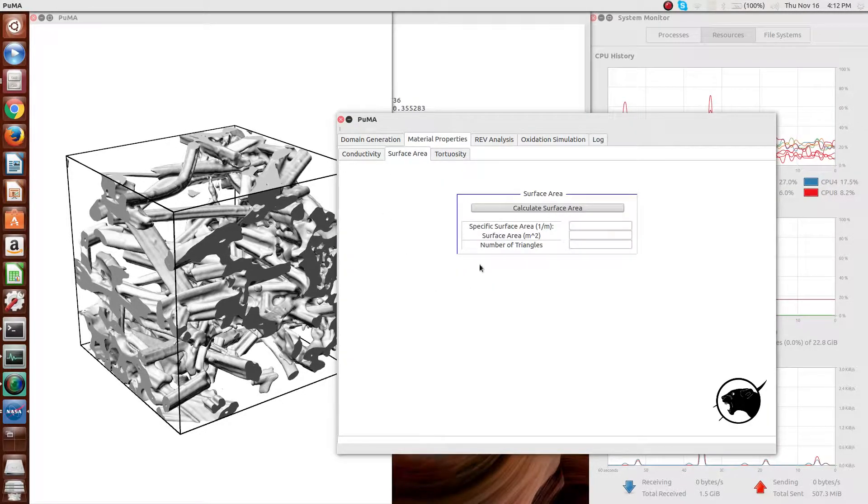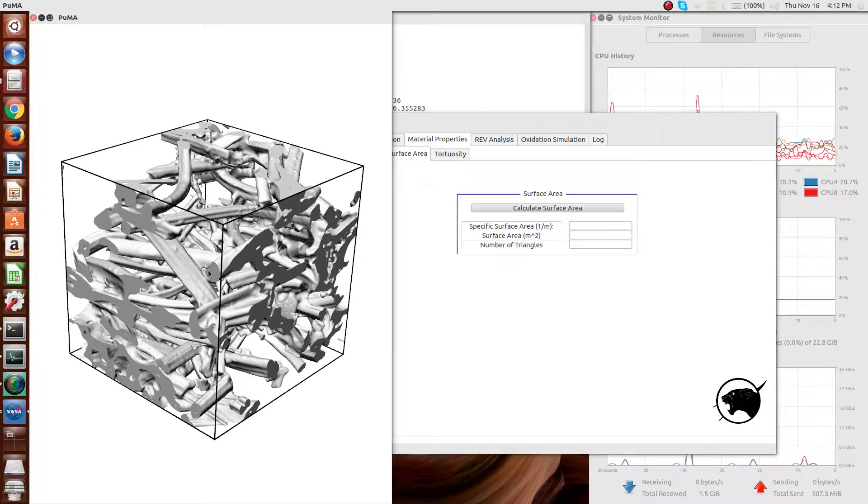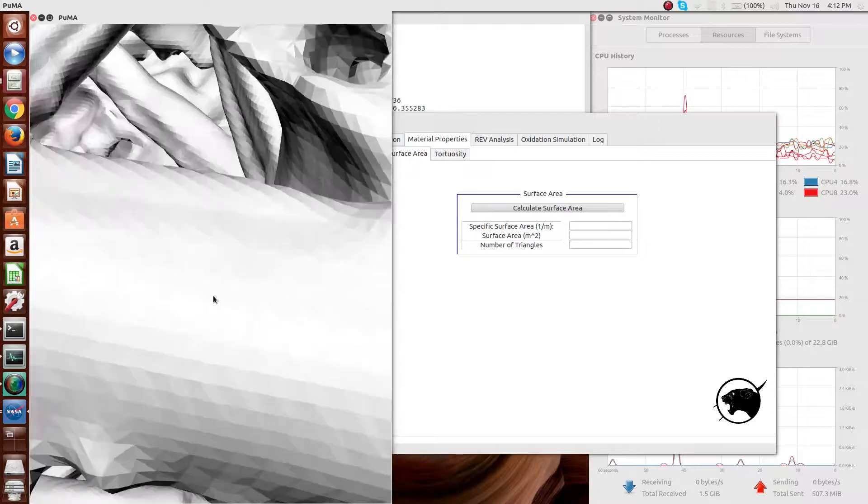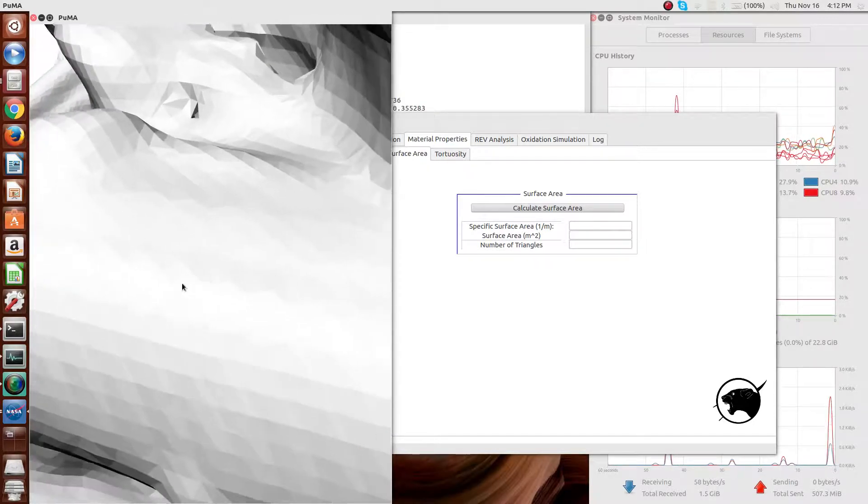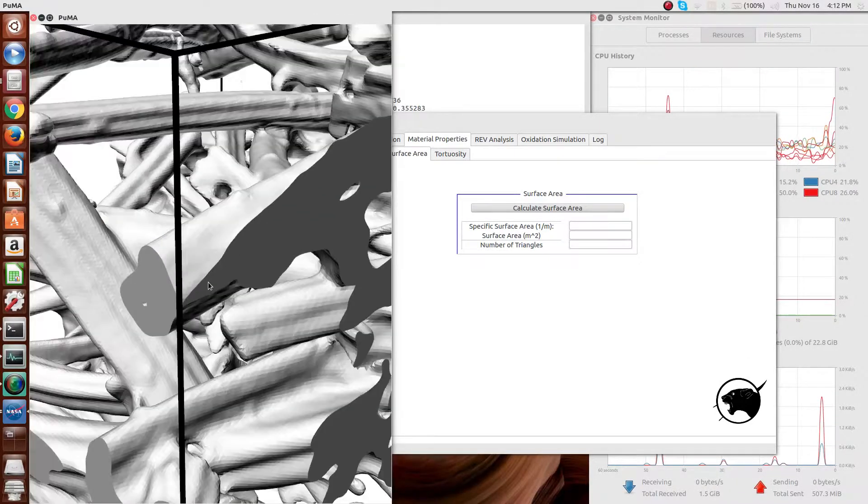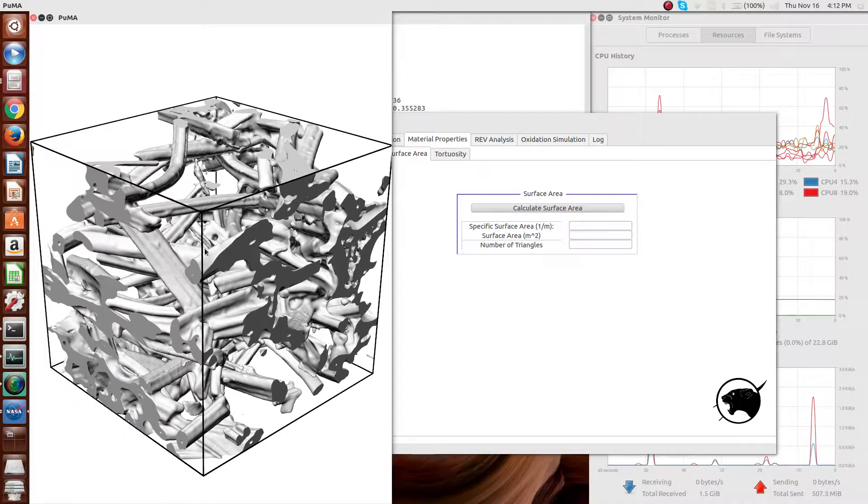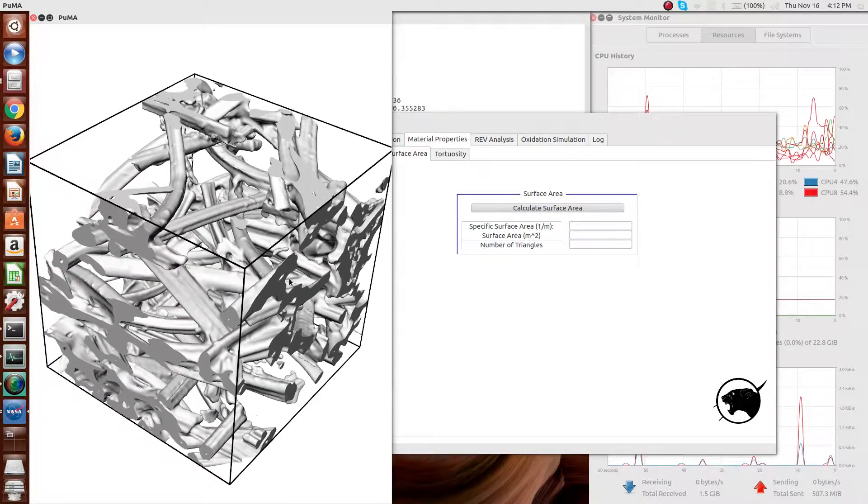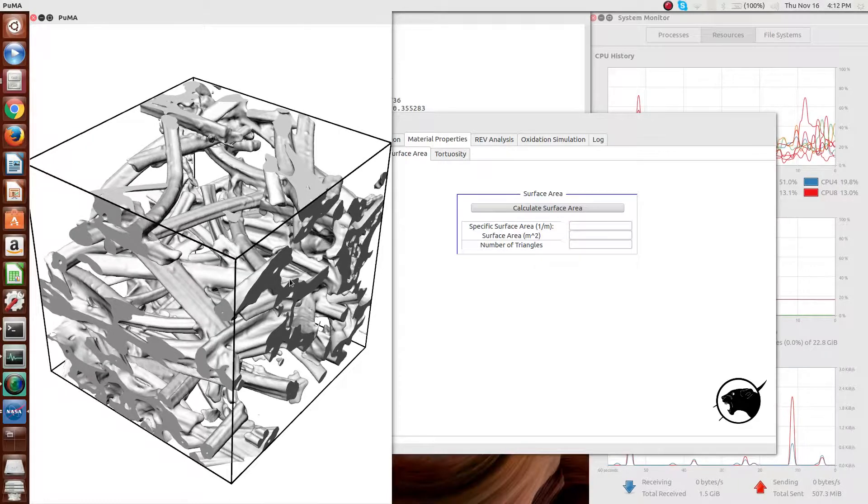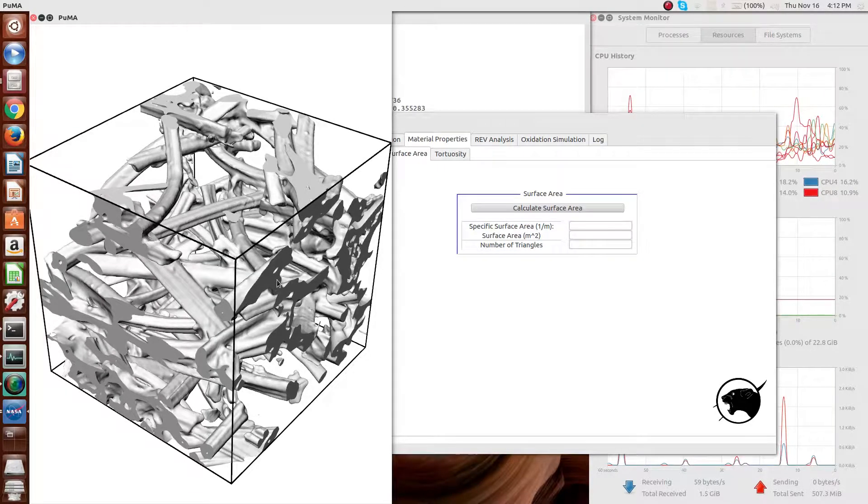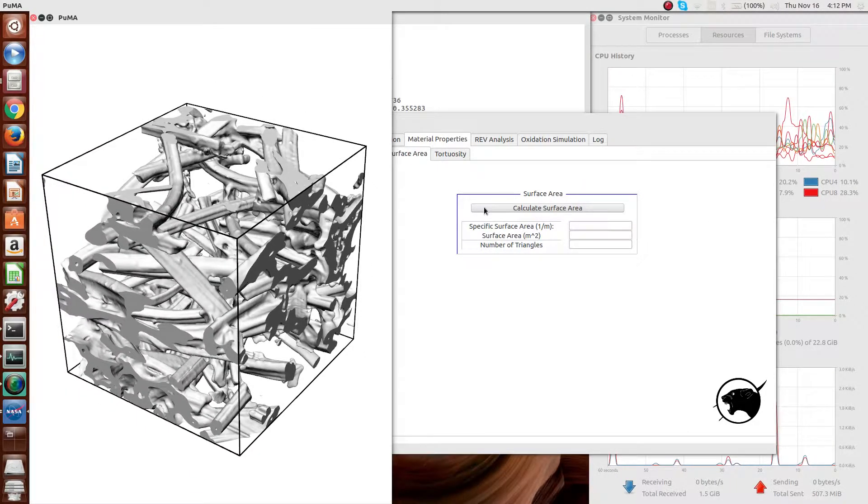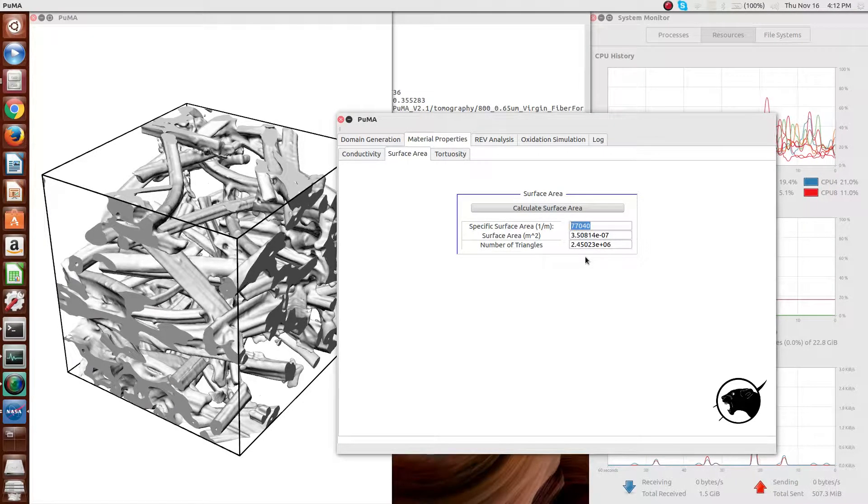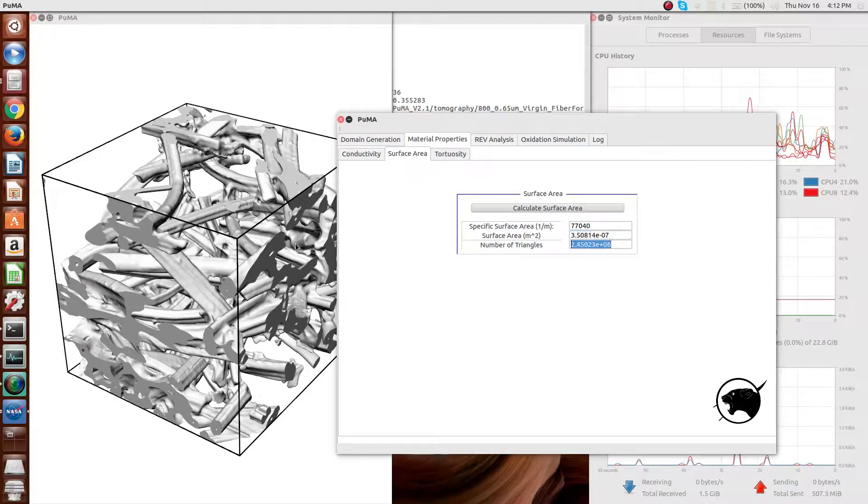The next material property is the specific surface area. If you see here, if you can zoom in, you see that this is actually made up of triangles. This visualization is a collection of triangles, probably a few million triangles in this case. The sum of all the areas of these individual triangles can be used to compute the surface area, which is done here. So you see the specific surface area is shown, which is the surface area divided by the volume, as well as the raw surface area.